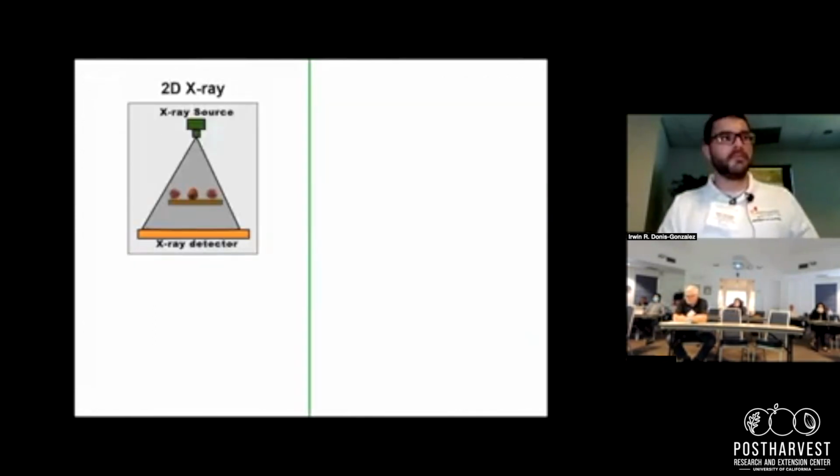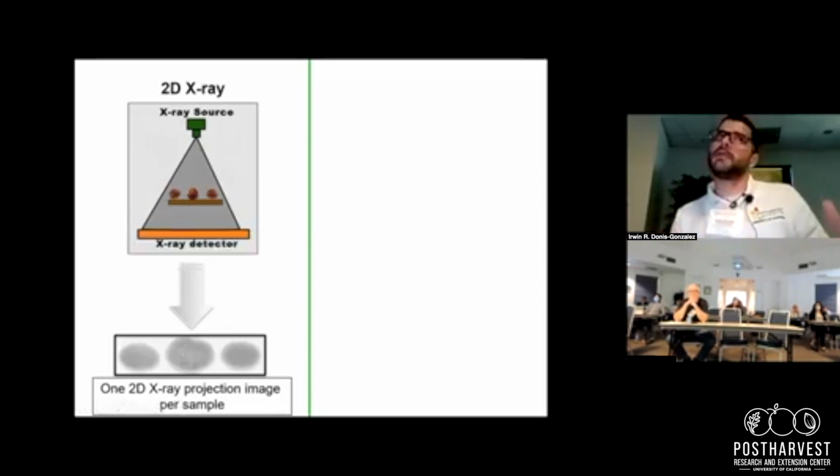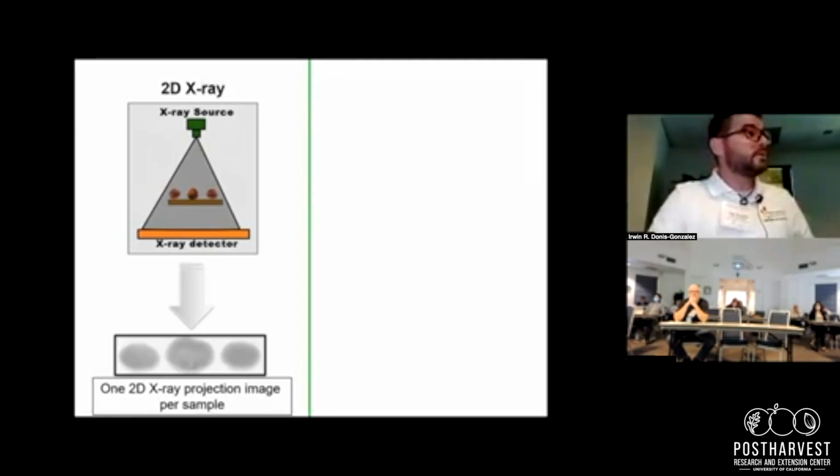Of course, there are different methods or different wavelengths that we could use. And I had the pleasure of working with the company that Tomra bought, which was BEST, Belgium Electronic Sorting Technologies. That was one of the first developers of X-ray imaging, and these images were taken with that BEST electronic technology. This was my PhD, actually, assessing if we could determine quality attributes of chestnut specifically using X-ray. What we found is that, unfortunately, the changes in density between the defective tissue and the tissue that is not defective were too close, so we couldn't really discern quality attributes. That doesn't mean that this system is not valid, because there are other applications that I'll show later.